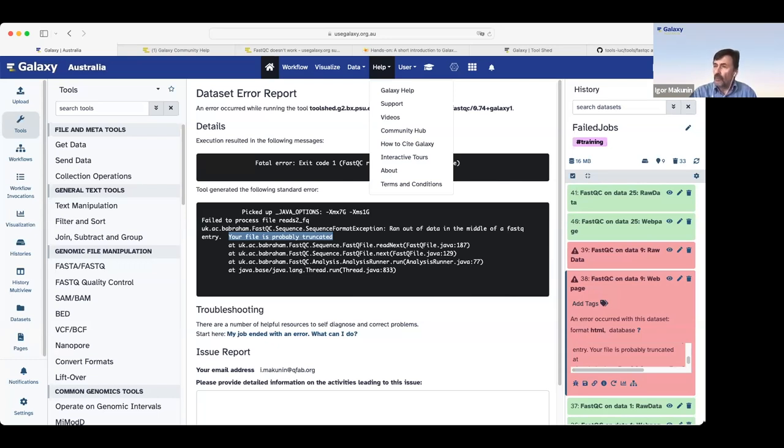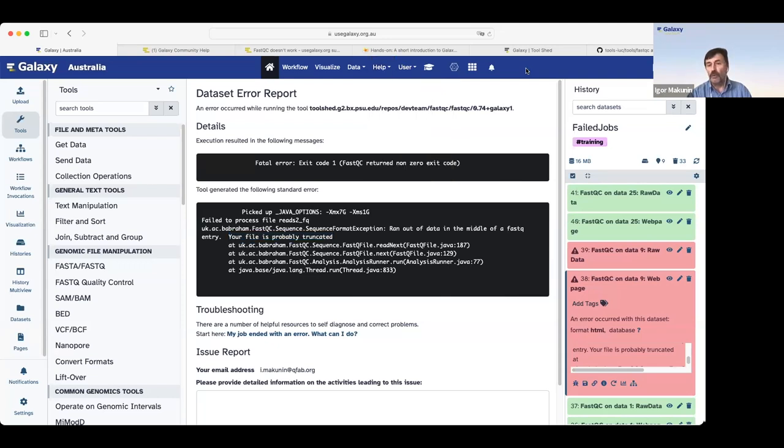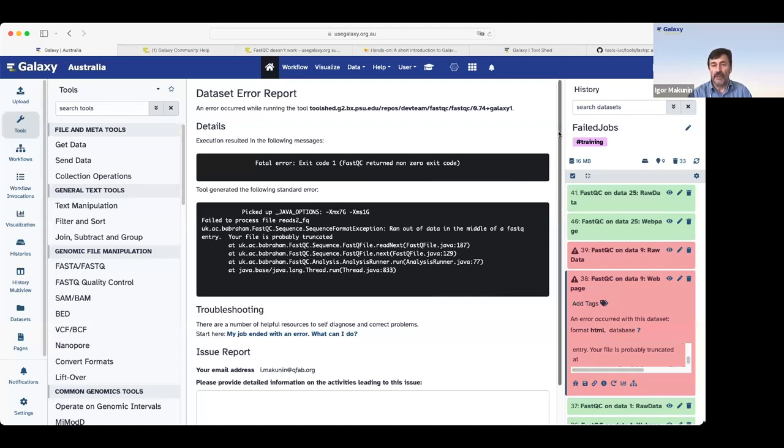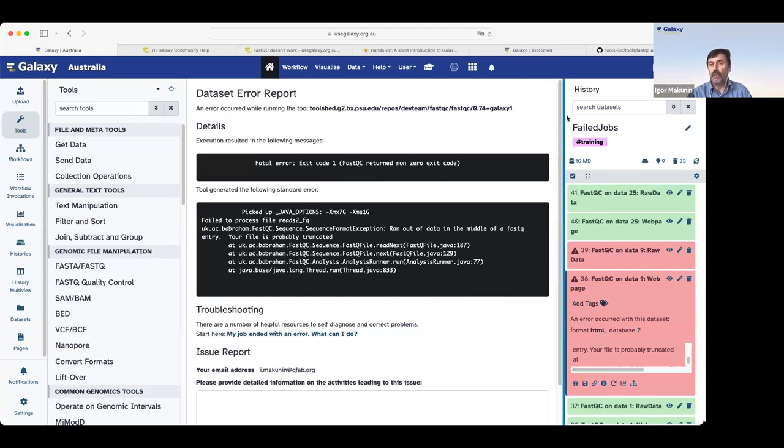We can divide failed jobs broadly in two groups. In one group we can put failed jobs where an error is caused by datasets or conflicting settings or other things that are under user control. That means that users can resolve those errors on their own. Once they figure out what's going on, like in this case, file is truncated. So we need intact file for this tool.